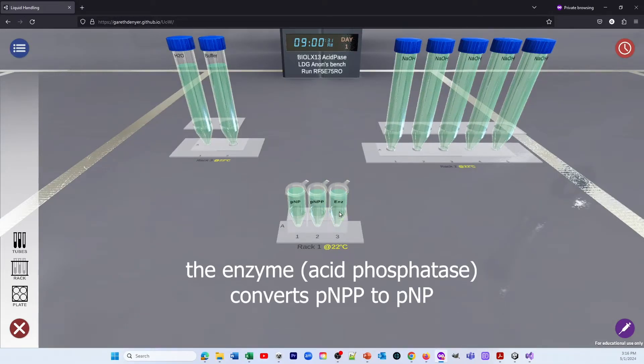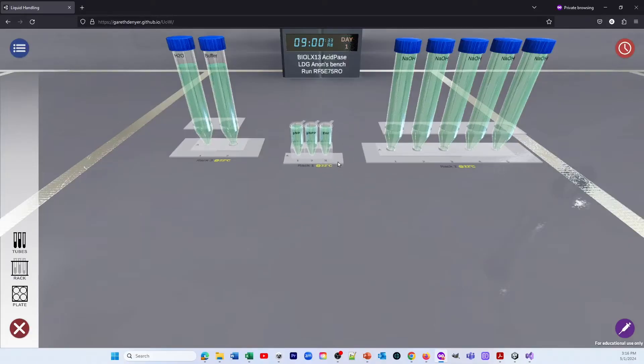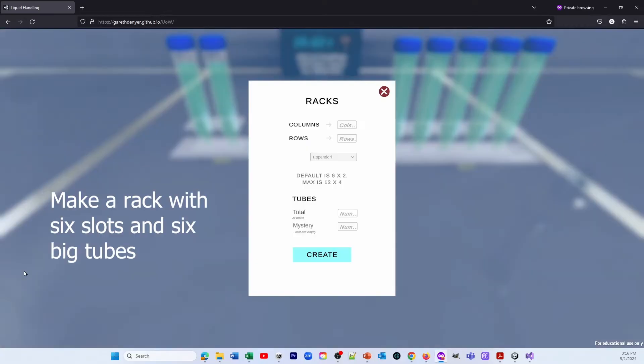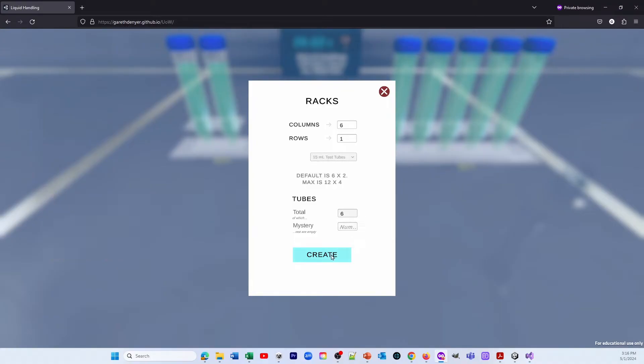But the first thing we've got to do is make a standard curve, and to do that we're going to generate a rack of 6 big tubes. So we make 6 slots, 6 columns, 1 row, we select the big tubes, the 15 mL tubes, and we select 6 of them, and then we click Create.